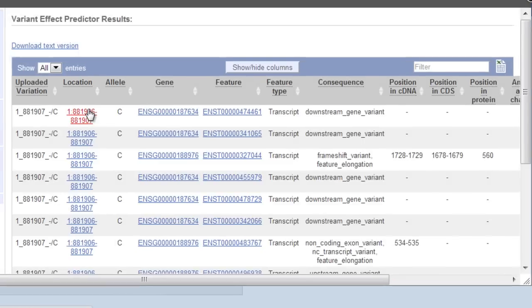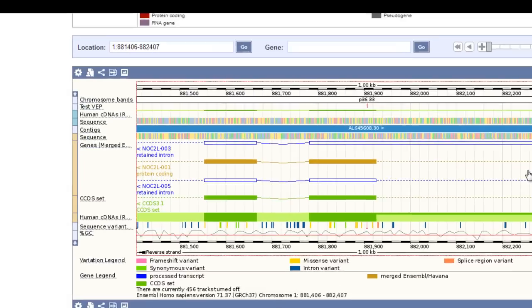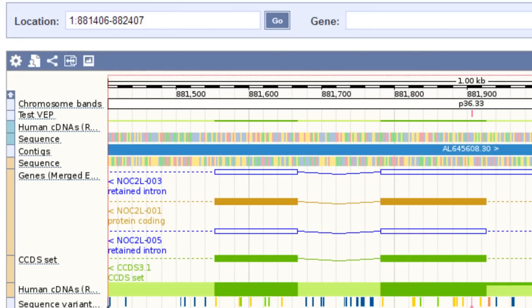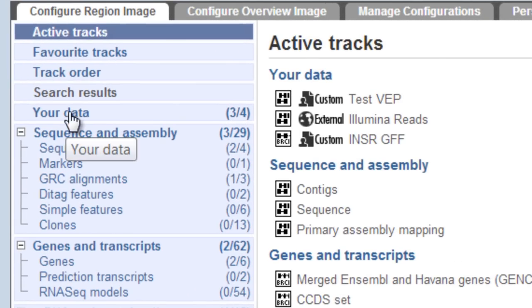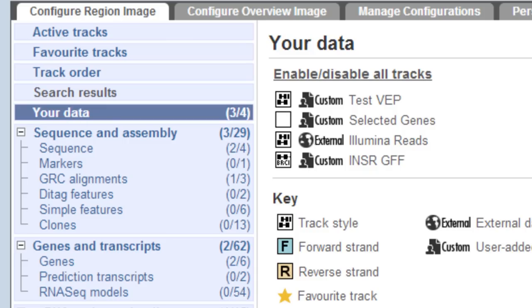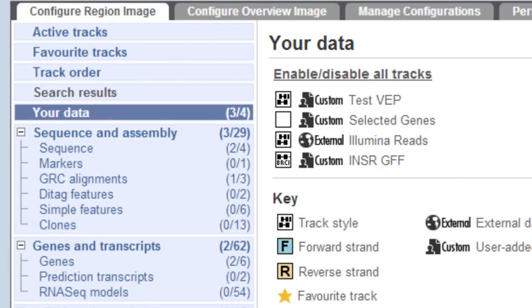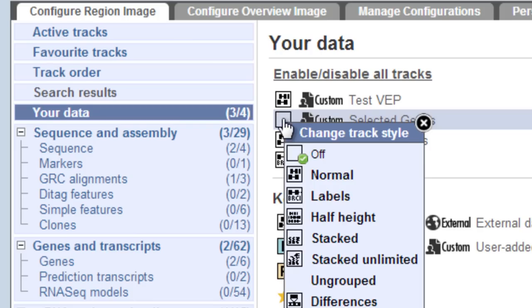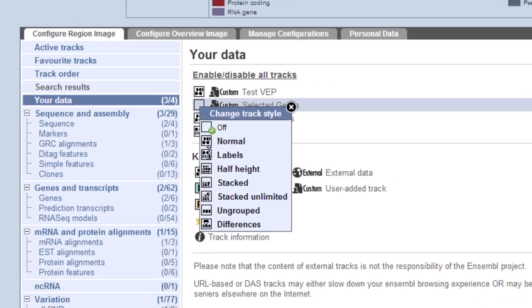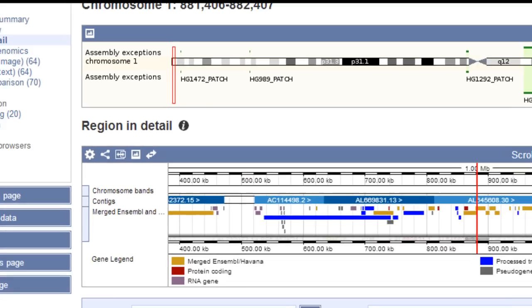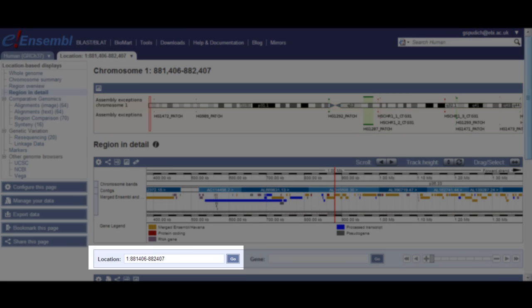If I follow the link to a location, I go to the Region in Detail page, and a Test VEP track will be turned on. If I click the cogwheel icon, you may see there is a Your Data menu. This allows me to display my data tracks within the Region in Detail view. All three of the data tracks are turned on here. I can also turn on those selected genes from Features on Karyotype and select normal or labels. These will only be displayed if I'm in the correct region — for example, I'm in chromosome 1, so I would have to navigate back to chromosome 20 to see other tracks.